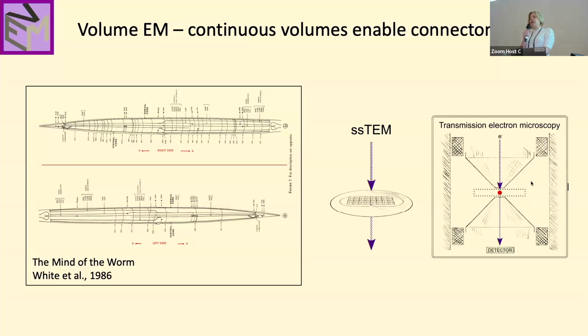Yesterday, I was very honored to visit an EM facility 7 minutes walk away, where Dr. Gabuto has one of the automated versions of this called grid tape TEM. And they're doing amazing imaging over thousands of sections automatically fed through the TEM and spitting out petabytes of data.